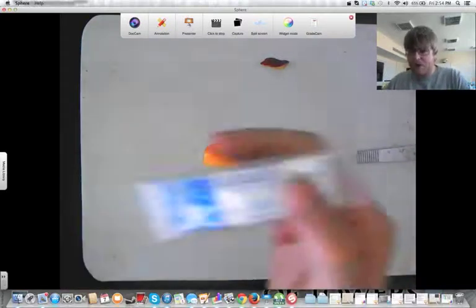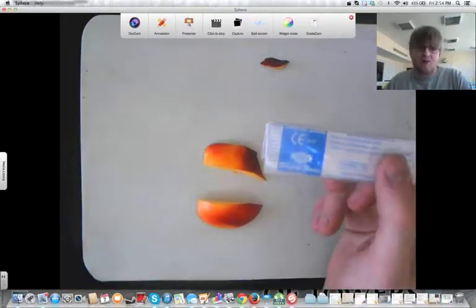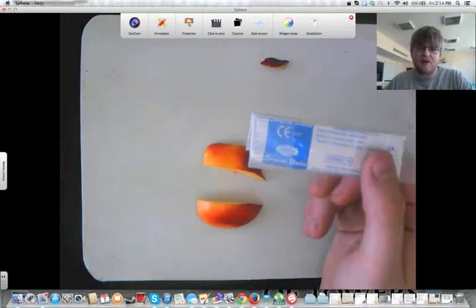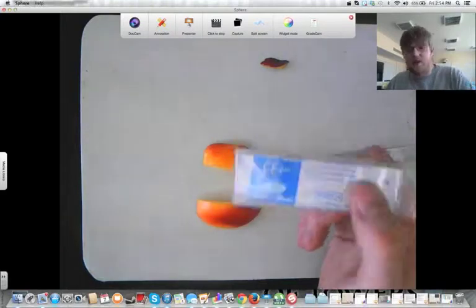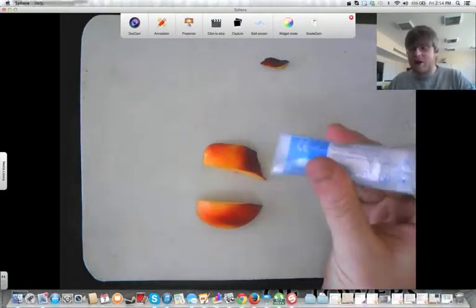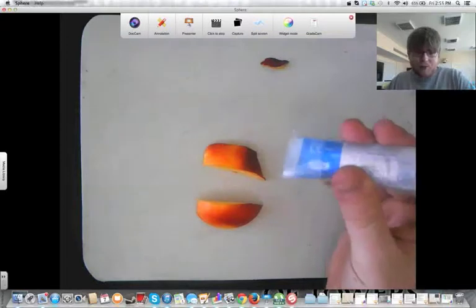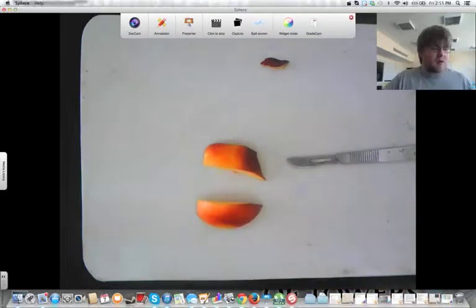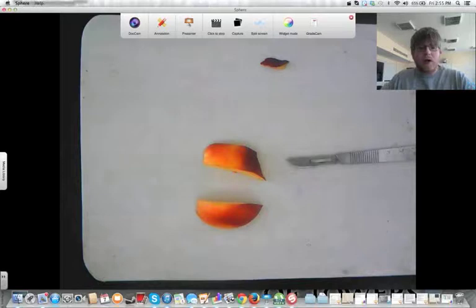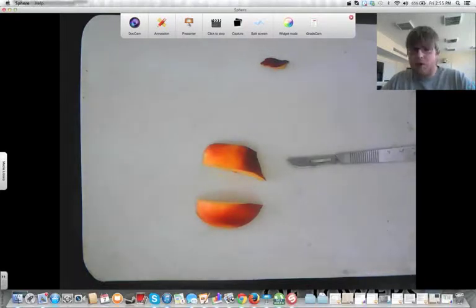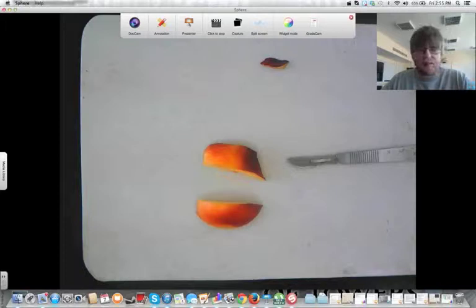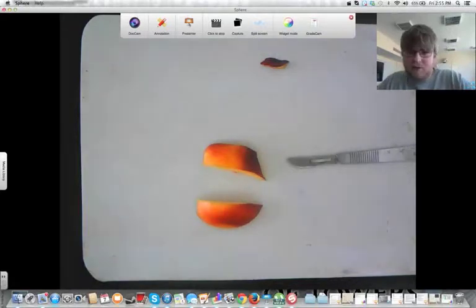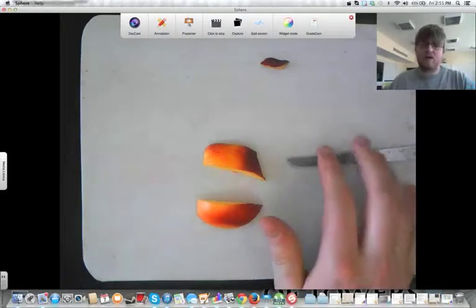If that happens, there are extra scalpel blades inside a package in your dissection kit. If your dissection kit doesn't have any for any reason, you can get more pretty easily. If you do need to replace the blade, just get me to come over to help you guys out so that the blade doesn't go flying anywhere and so that you don't lose a finger while you're putting the blade back onto the scalpel.